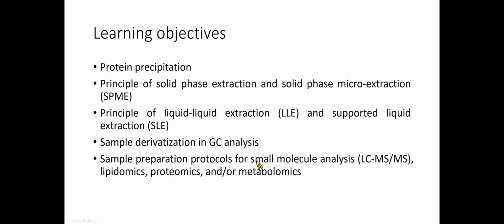In this lecture, you will learn the principle of a variety of sample preparation techniques, including protein precipitation, solid phase extraction, solid phase microextraction, liquid-liquid extraction, supported liquid extraction, and derivatization steps in GC analysis. Lastly, we will go through some commonly used sample preparation protocols for different kinds of mass analysis.